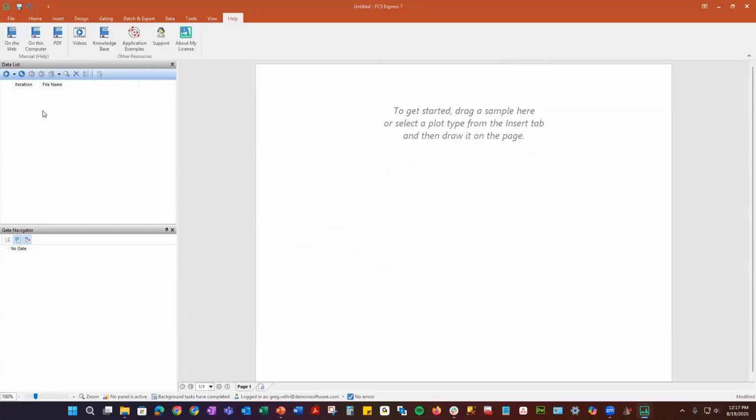So let's bring in some data, now that we've gone through a brief summary of what we have here. Let me get some data here for us.